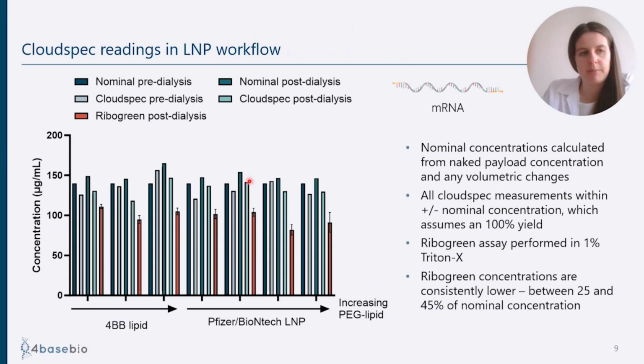So to give an example of what the CloudSpec can do in terms of lipid nanoparticles and how those measurements look throughout the process, these are just some nanoparticles. The formulations are not really relevant, but they are encapsulating mRNA in this case. The nominal concentration is just what we have calculated from the naked payload concentration that we took prior to encapsulation and any volumetric changes that occur during those processes. And in this case, the nanoparticles were measured pre-dialysis and then just a standard post-dialysis measurement in a standard dialysis cartridge.